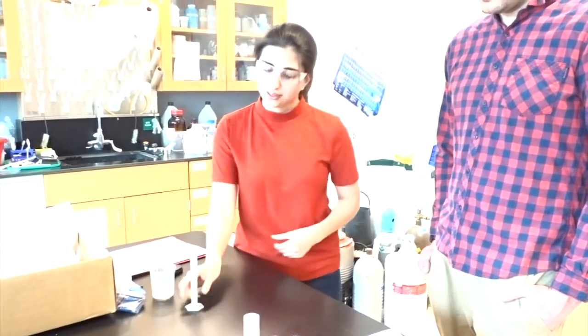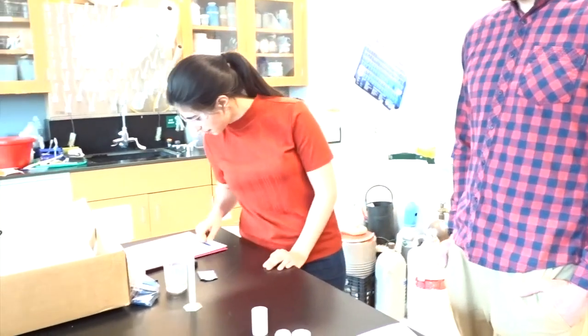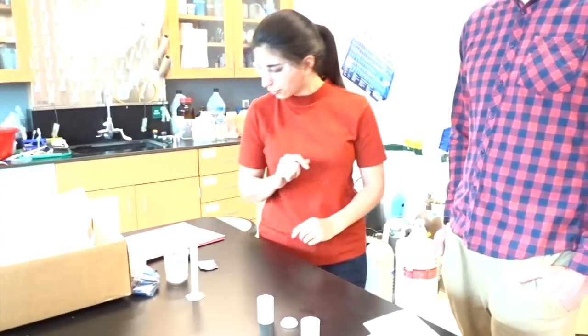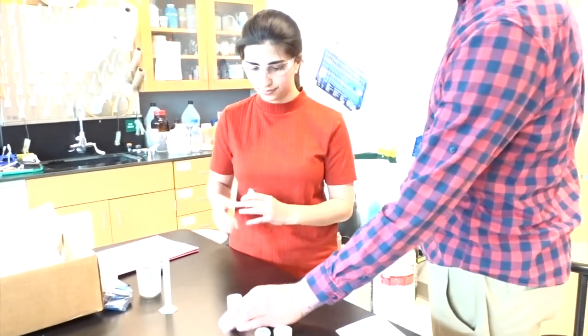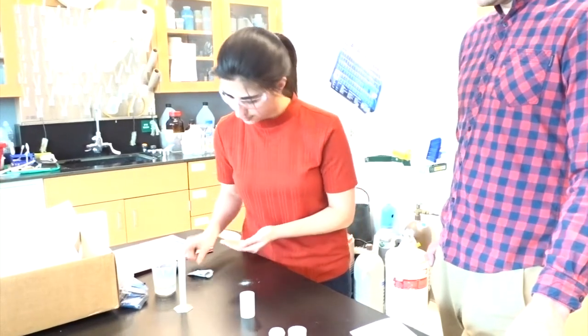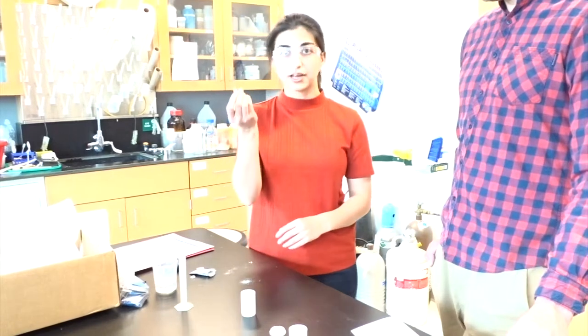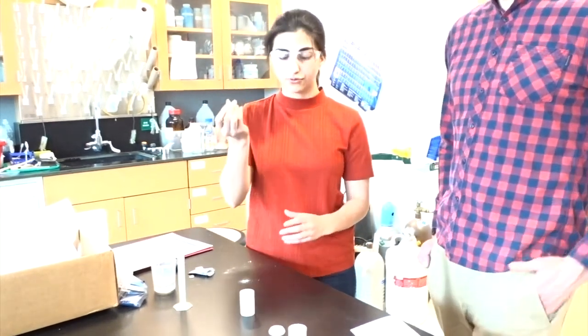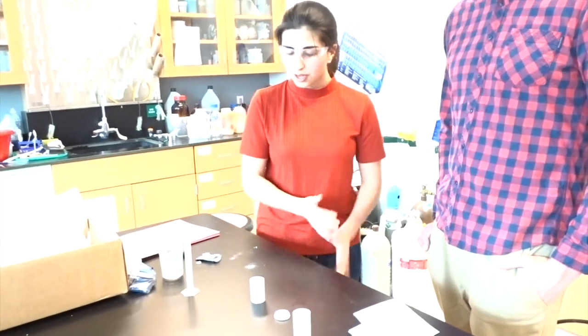Lovely. So now that we have our 10 milliliters of water, we will then do our next step, which is to add the solid quarter tablet to the film canister, which is not in there right now. So this is about a solid fourth of a tablet. Go ahead and add that to the film canister.